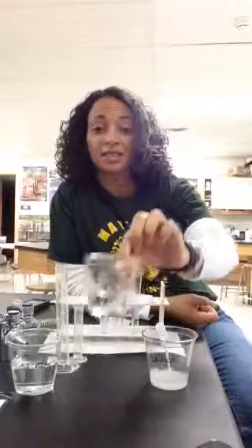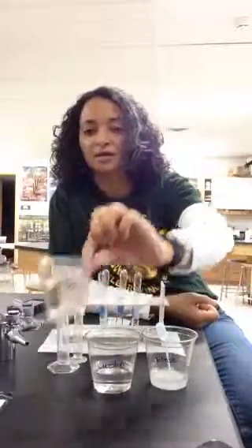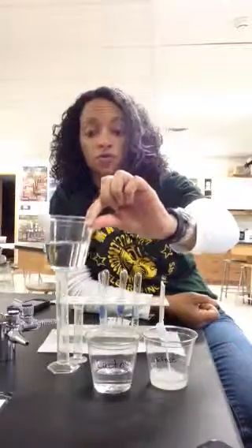Hello everybody. Today we're going to be doing a lab to test the action of the enzyme lactase on two different disaccharides. The first one we're going to test it on is a disaccharide called lactose. The second one we're going to test it on is a disaccharide called sucrose.